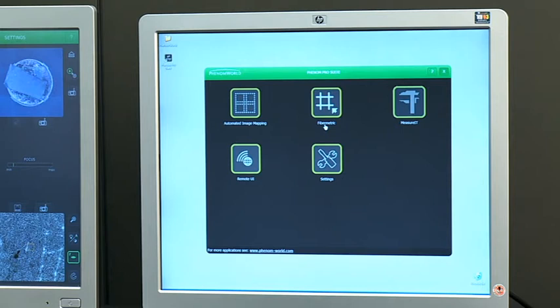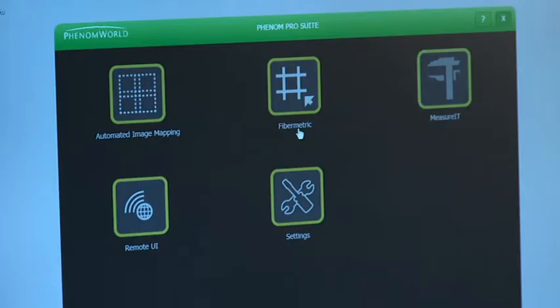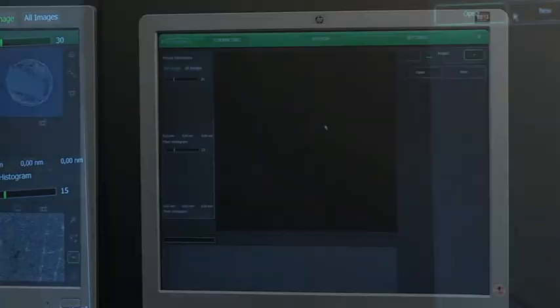FiberMetric has a four-step wizard to guide the user through the project. An image is collected automatically when a new project is opened.